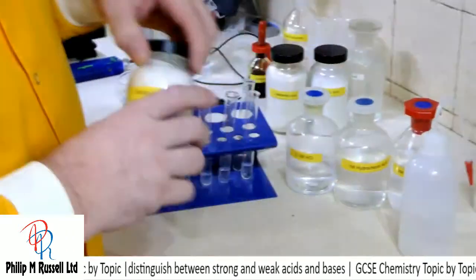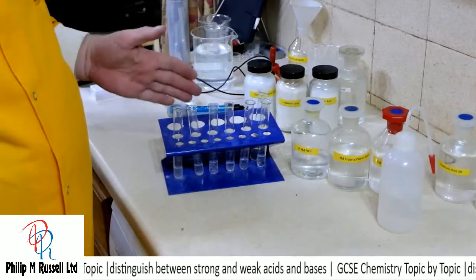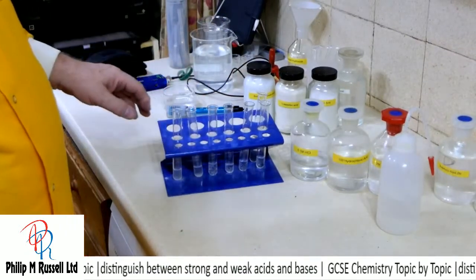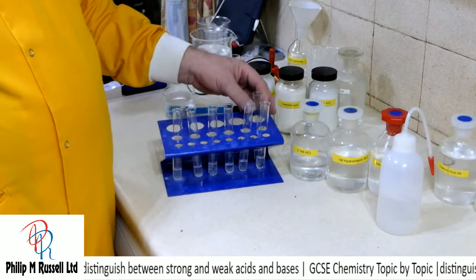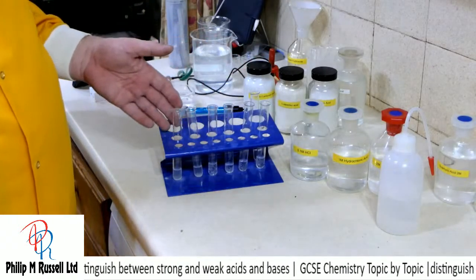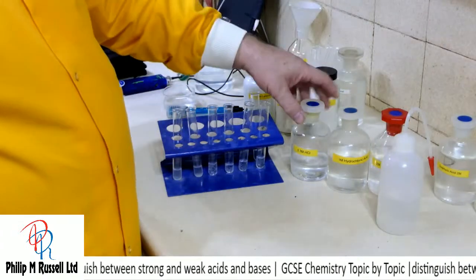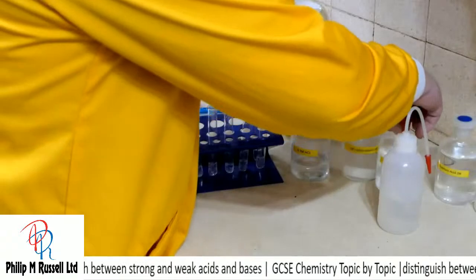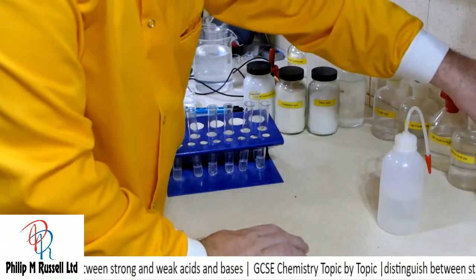We're seeing less going on because there are fewer hydrogen ions in there to do anything. Now if we dilute this more and more and more, we can start to see less and less reaction.